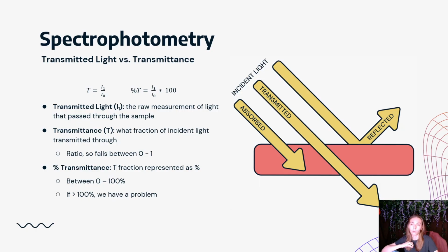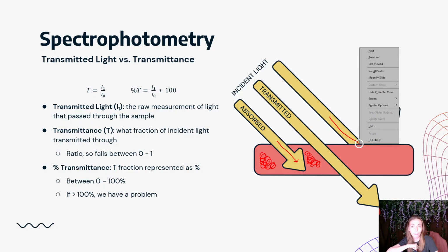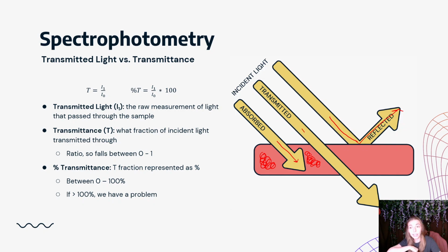So what's absorbed? That energy goes into the solution and dissipates within your specimen. The more your concentration, the more gets absorbed. What is reflected? The light, the energy, everything goes and hits the sample and goes, boom, bye, not my problem. What's transmitted is the light, the energy that manages to make it all the way through the specimen and keeps going because nothing stopped it.